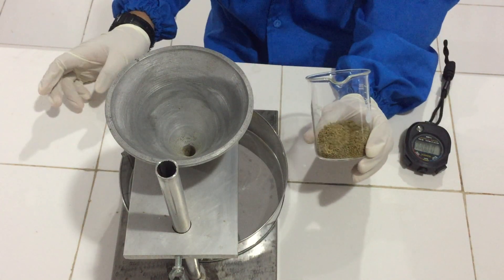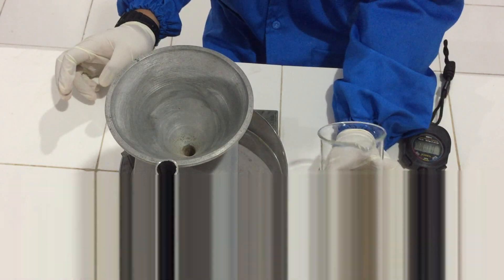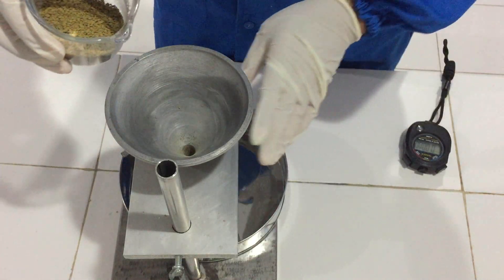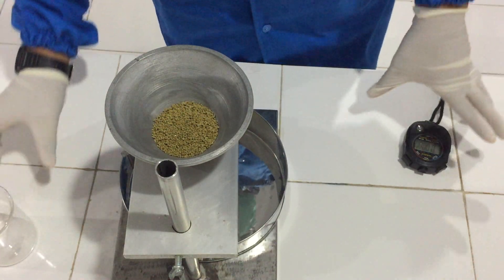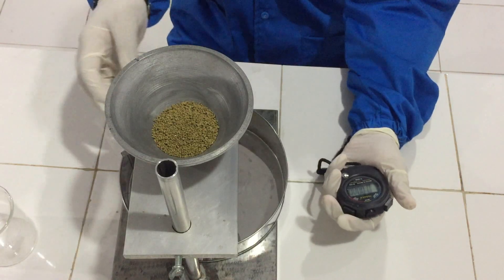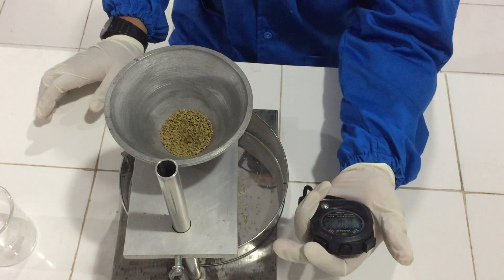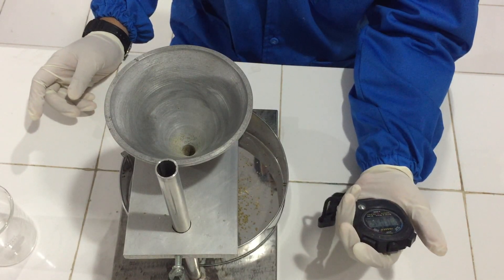Kita sekarang sudah mendapat granul dari percobaan sebelumnya, yaitu granul ekstrak etanol daun kelor. Kita akan melakukan uji alir pada granul. Kita masukkan ke alatnya — untuk uji alir hanya membutuhkan 25 gram granul. Kemudian kita sediakan stopwatch. Kita buka bersamaan dengan stopwatch. Uji alirnya yaitu sekitar 0,035 menit.